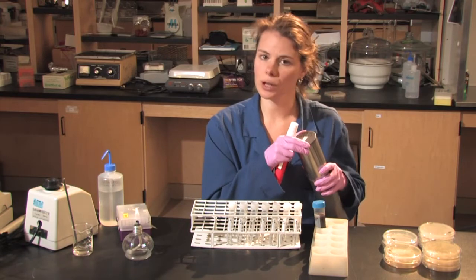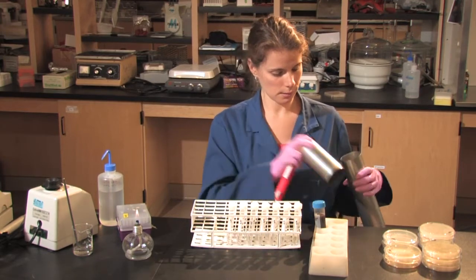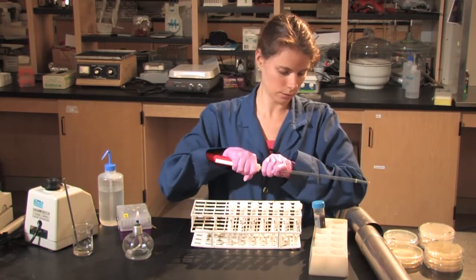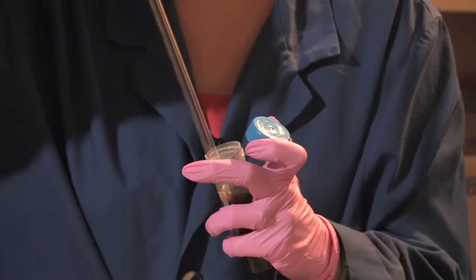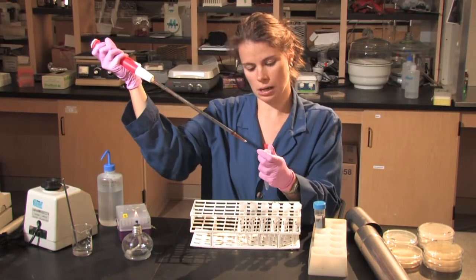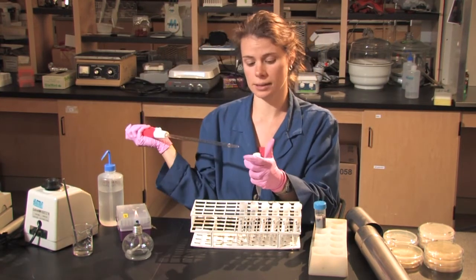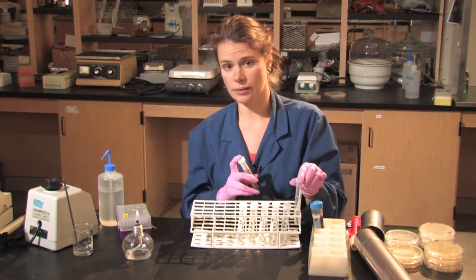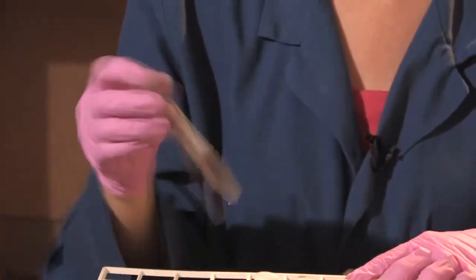This is typically done aseptically in a flow hood, but to make it easier for us to visualize, I'm doing it here. I've got my autoclaved Pasteur pipettes, and I'm going to add 1 mil of the 10 to the 0 soil solution to 9 mils of distilled water. This gives me a 10 to the minus 1 dilution. I would continue along in this manner until I get to 10 to the minus 7, and then vortex each dilution, again distributing the sample.